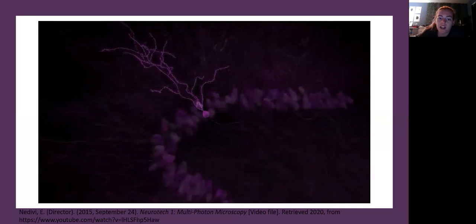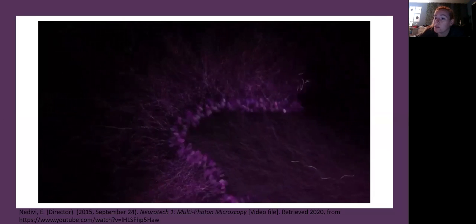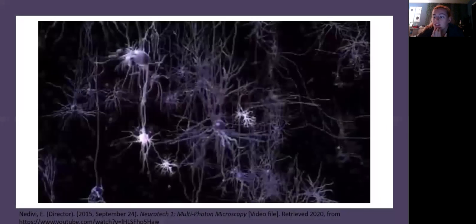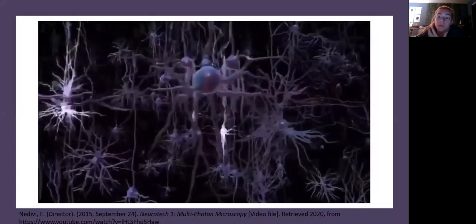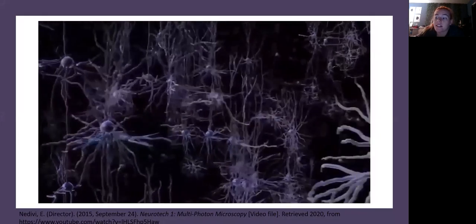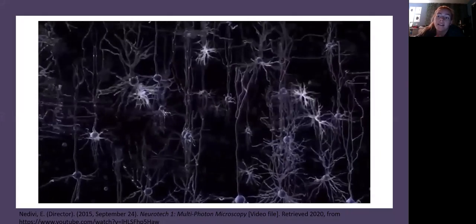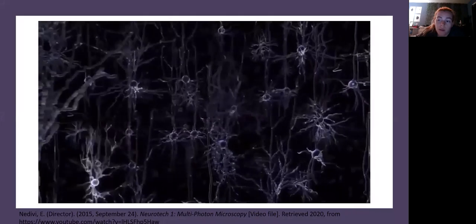And as the technology advances with it, there needs to become the ability to also diagnose specifically what's going on with these other changes. And as this information becomes more widespread and more able to be used by other people, things such as the label-free multi-photon microscope can aid in better diagnosing patients and creating a better environment for doctors.